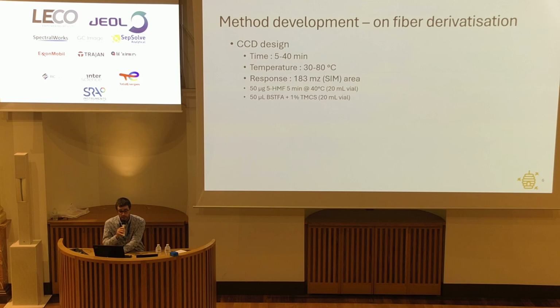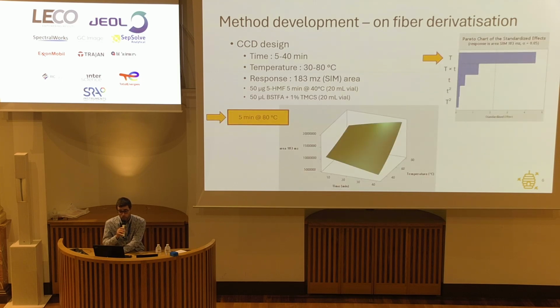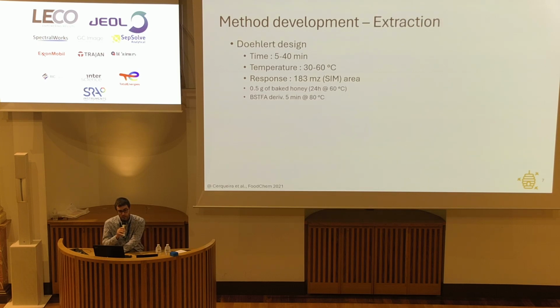We used a central composite design for the time and the temperature. What we observed is that the temperature was leading the derivatization step. And so we derivatize for 5 minutes at 80 degrees. We also optimized the extraction. Here we used the Doehlert design, which is a hexagonal design.